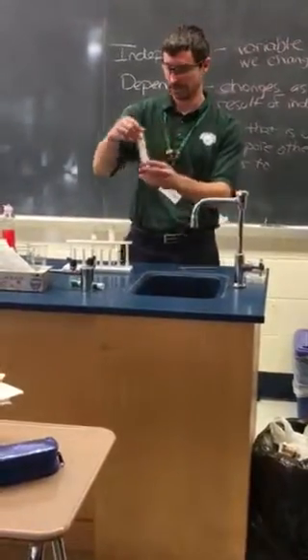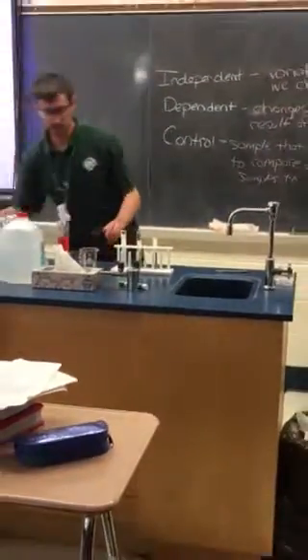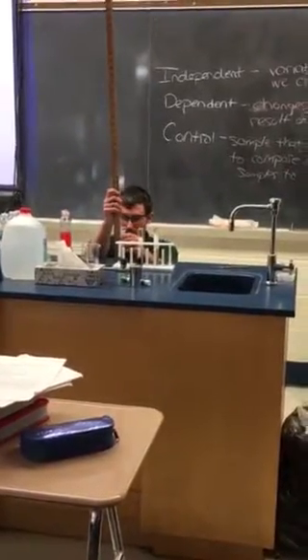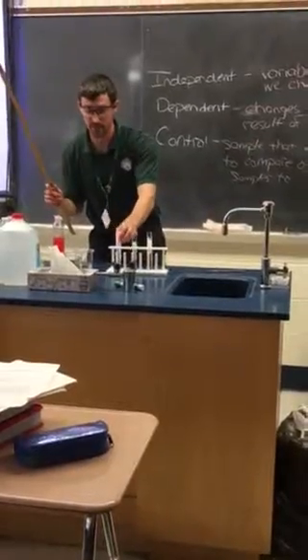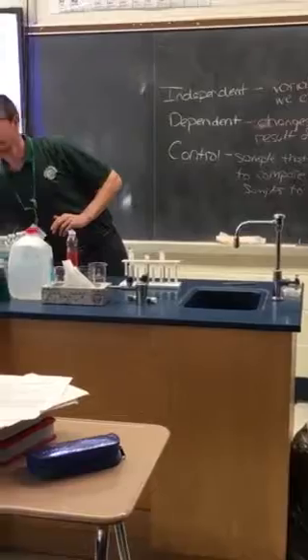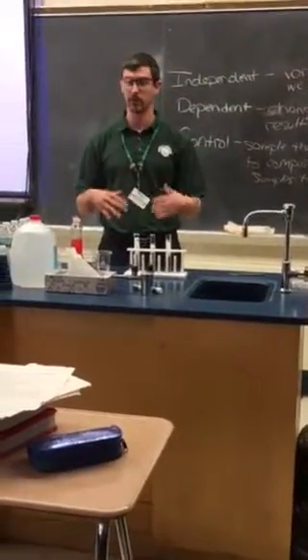And so lastly, you measured, and you want these quantitative measurements so you can get a good reading. Okay, and this one is 7 centimeters, so we got 5, 3, and 7. So you'll record that in your measurements. 2 minutes later, you'll then record again.